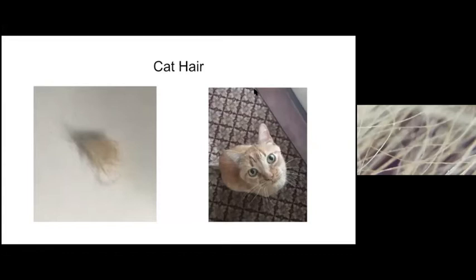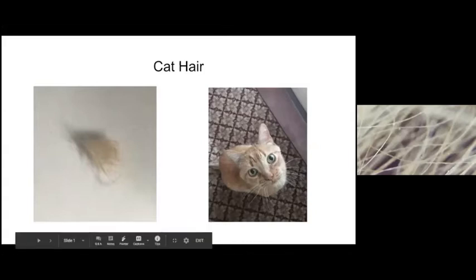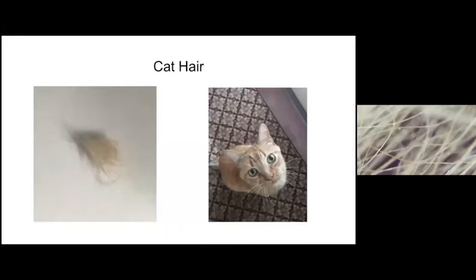They actually look like straw. You think the hair looks like straw? I kind of agree with you, actually. It looks really strange under the microscope. Well, and it's about the same color as straw, so maybe this cat would blend in a barn, right? Because somebody said it looked like straw, somebody else said it looked like hay, so maybe this cat could be really sneaky in a barn where there's lots of hay and straw.